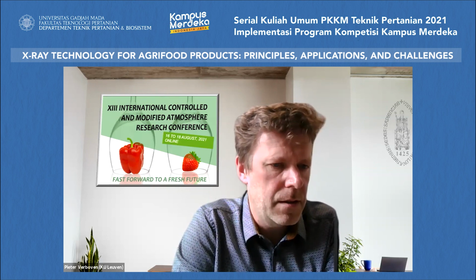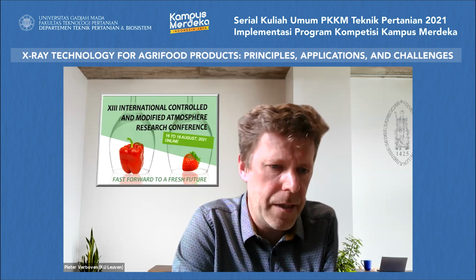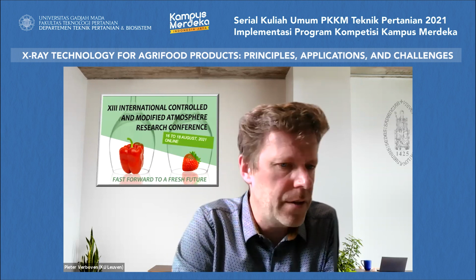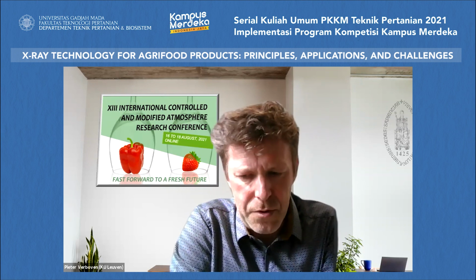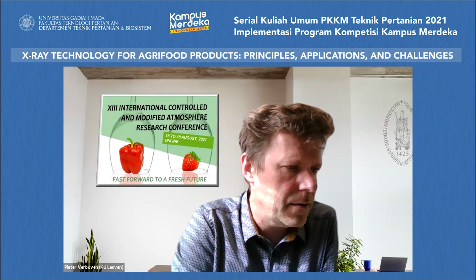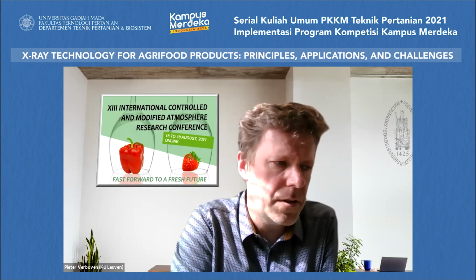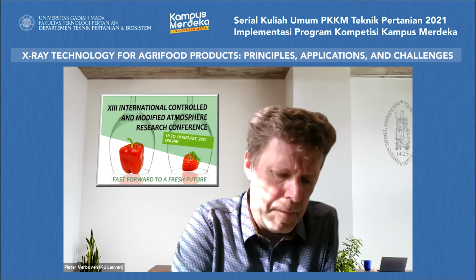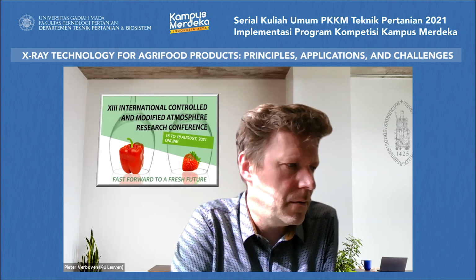Like where I showed you the instrument where we are scanning the pears for defects, that imaging is very fast. And also the whole image processing along with it can be done in sub-second time, because it's a very fast algorithm. It's only 2D imaging with a line scanner, which is on a conveyor belt operating at commercial speed.